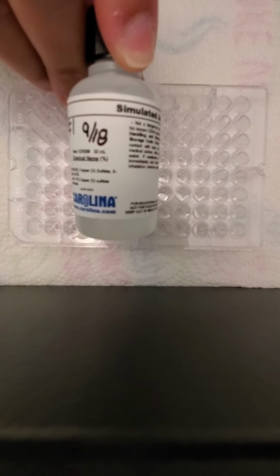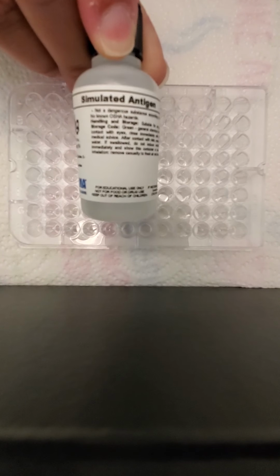All right, so today we're going to run through the process of doing an ELISA. So remember, an ELISA is looking for antibodies that are specific to a pathogen. So the first thing that we have to do is include in the wells the simulated antigen. So for example, in this one, it would basically be the fact that we're putting in the wells what we're testing for. So let's say that we're testing for HIV. So we want to put in the antigen for HIV to see if the patient's serum has antibodies to that antigen.